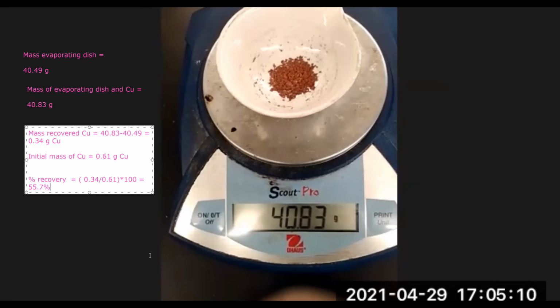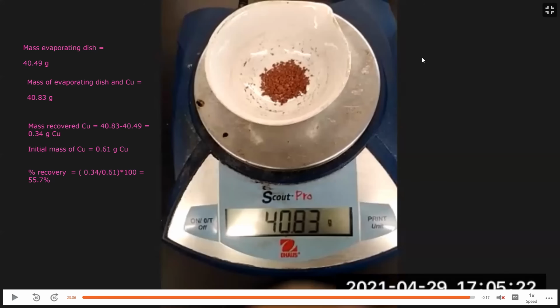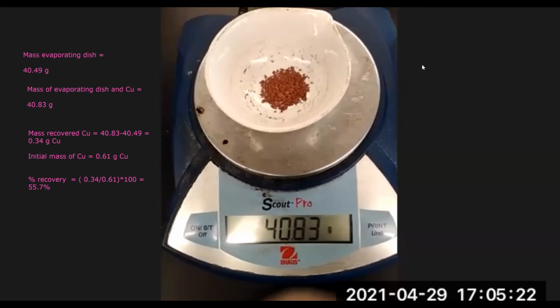So if you don't get near 100% recovery, you need to think about where you may have made mistakes in the experiment. Was it the washing? Was it the extracting of the solution, etc.? One last thing is the way you know that your copper is dry is that when you take the evaporating dish and kind of move it with your hand, the copper moves freely in the dish. It's not clumpy. So that's a good indication to know when your copper is fully dry.